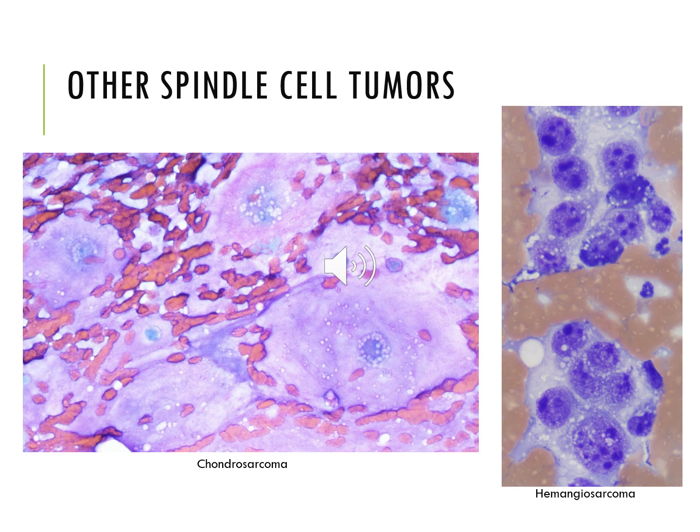The image on the right is an example of a hemangiosarcoma. I will tell you that hemangiosarcomas do not exfoliate well at all, which kind of makes sense. It's just a ball of neoplastic blood vessels that are arranged in a haphazard manner and just a disaster. And so the cells themselves don't exfoliate well, and so we tend to just get blood on the samples where people are suspicious of hemangiosarcoma.